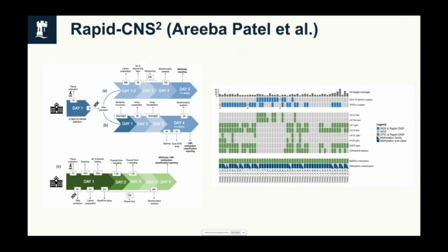In reality, what we're missing here is that the conventional pathway requires you to gather enough samples to run through your analysis pipeline and your library and laboratory pipeline, whereas with nanopore sequencing, you can just start sequencing on the device once you've extracted your DNA.